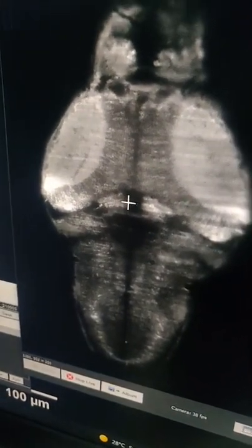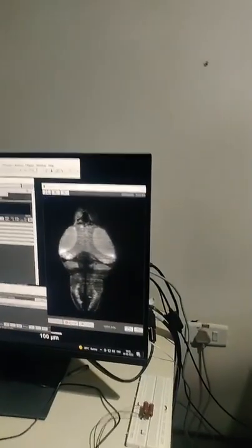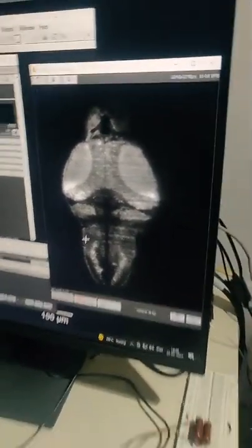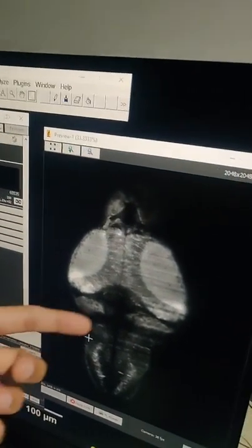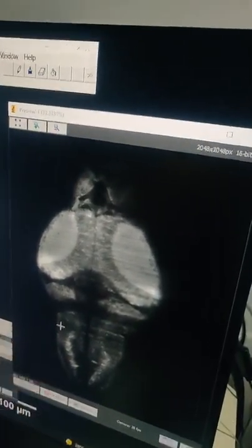That's what Shivangi probably talked to you about. Like we have, right? We also have a lot of these parts. Okay. And then we have the hindbrain here and the tail of the fish below. Okay. So that's the front, the part that helps the fish see things. Right. And this is the cerebellum. And then this is the hindbrain and the tail of the fish.